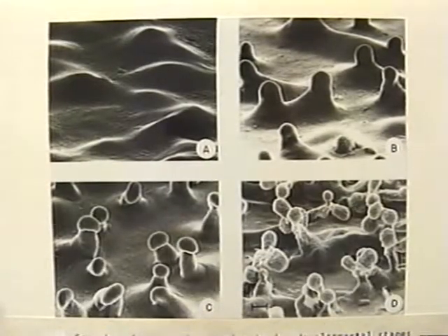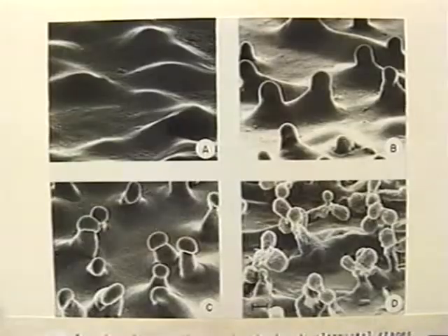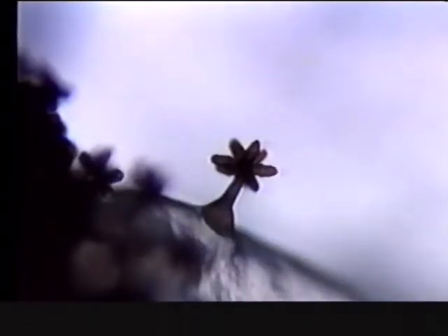And if the fruiting body is dispersed to a new location where nutrient is present, then the cells within the sporangioles will germinate, and a small population of cells will emerge. And here you see a fruiting body of Stigmatella aurantiaca. You can see the stalk supporting several sporangioles on top. What I have done is to remove one of those sporangioles and placed it on agar, and you will see it germinating, and when the cells come out, you'll see them gliding, and eventually you will see them approaching Micrococcus luteus and lysing them and eating them.